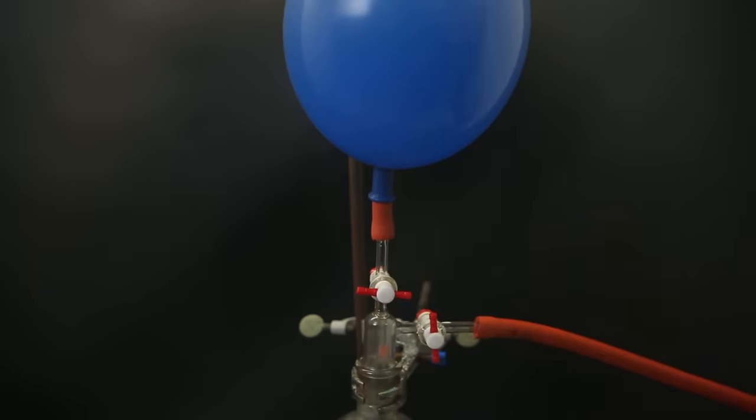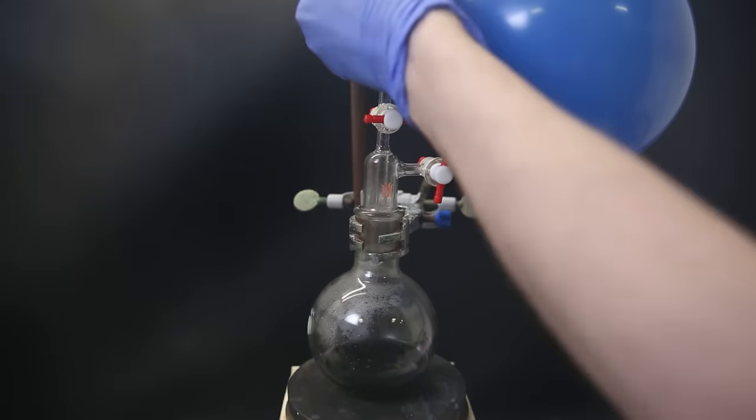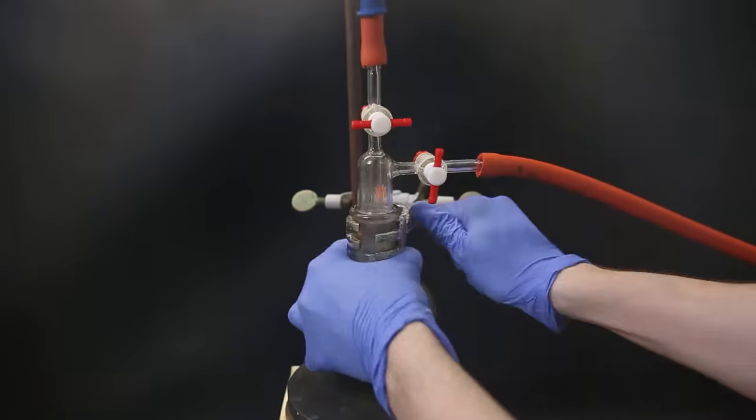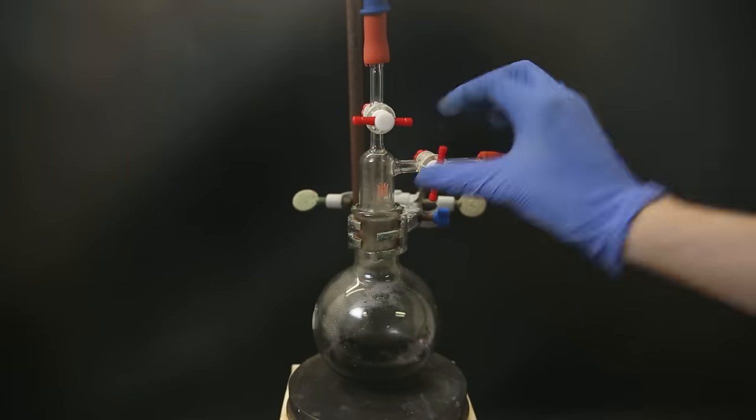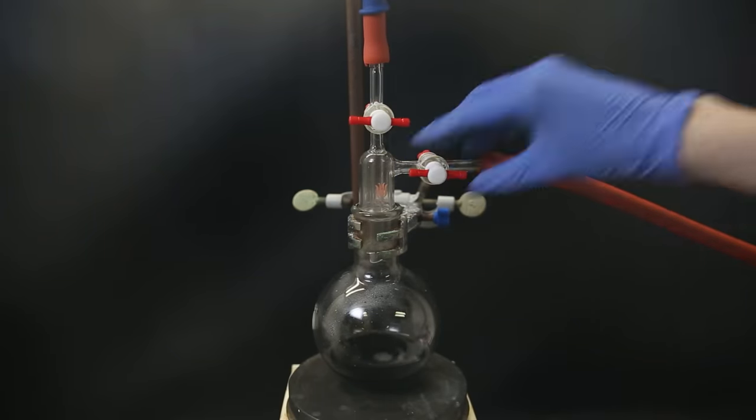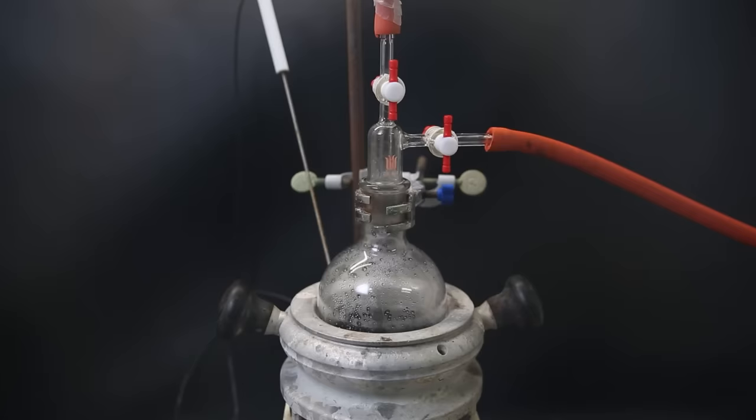I then replace a nitrogen balloon for a hydrogen balloon. I repeat the same steps to make sure that the flask is completely filled with hydrogen and then leave the way to the hydrogen balloon open. I leave this to stir at 35°C overnight.